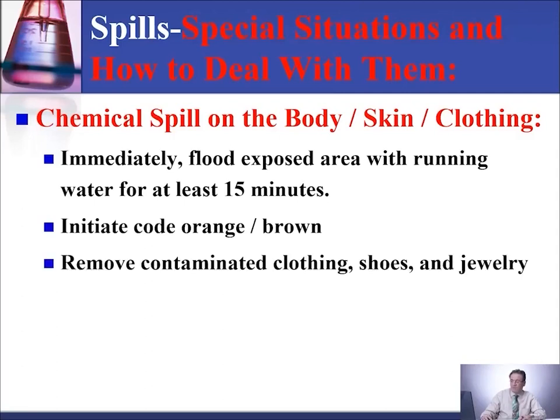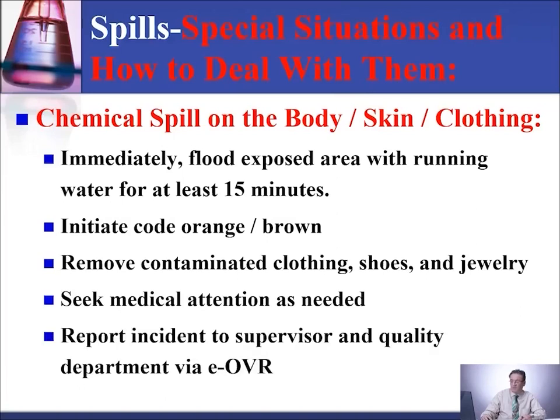Initiate code orange or brown. Remove contaminated clothing, shoes, and jewelry. Seek medical attention as needed. Report the incident to your supervisor and quality officer or the safety officer via EOVR, or follow your institution policy.